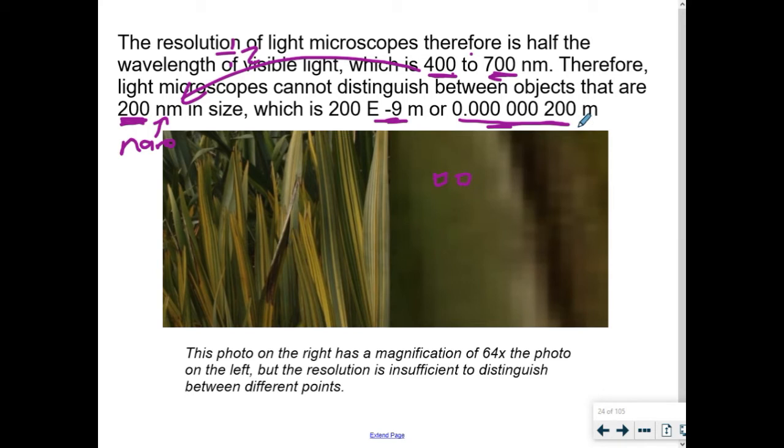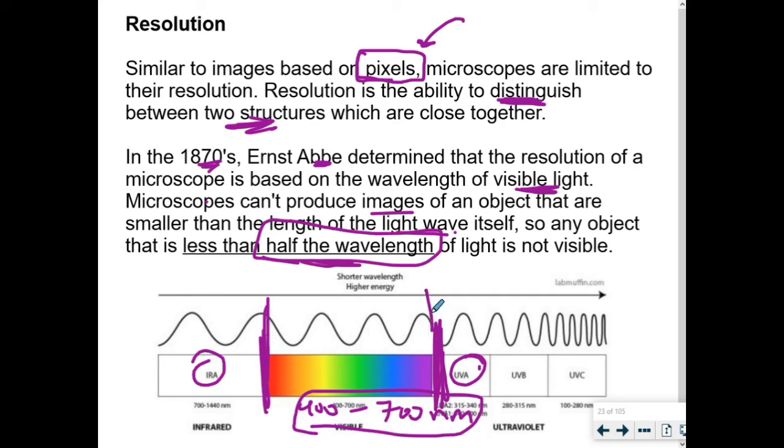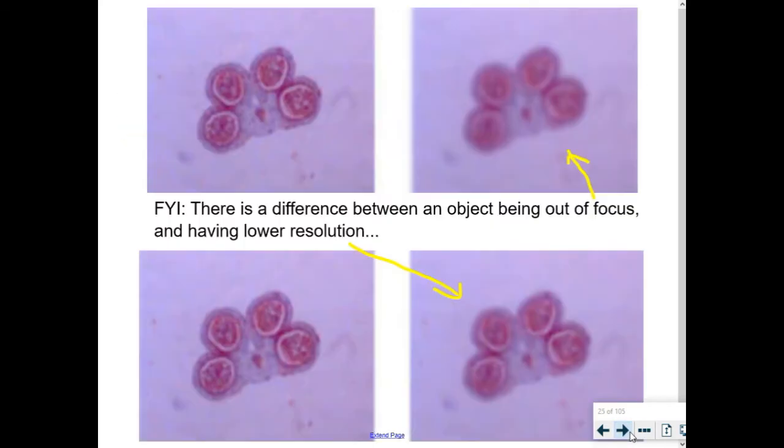You could add 1,000,000 lenses and try to zoom in that much. What limits our ability to see things? Our eyes. Our eyes see in colors. If our eyes could see ultraviolet, that would change things. If our eyes could see with X-rays, that would change things. Superman can use a better microscope because he can see with X-ray vision. Being silly, right? But we're limited based on what we're allowed to see because that's how we perceive things.